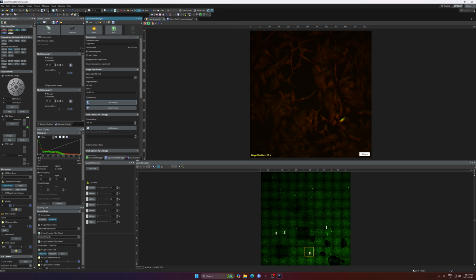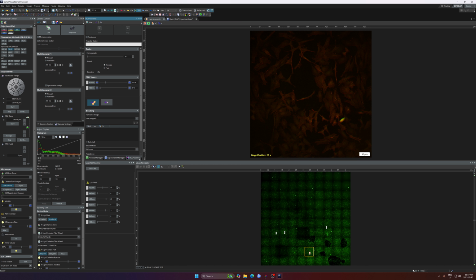Then we have to tell the software where our FRAP is going to be, which laser we are going to use. So we have two FRAP lasers, one's 488, one is 405. In this instance, I probably will bleach with 488. You can select the laser and give the laser whatever intensity. 405 is not activated, but I will check this to 0%.